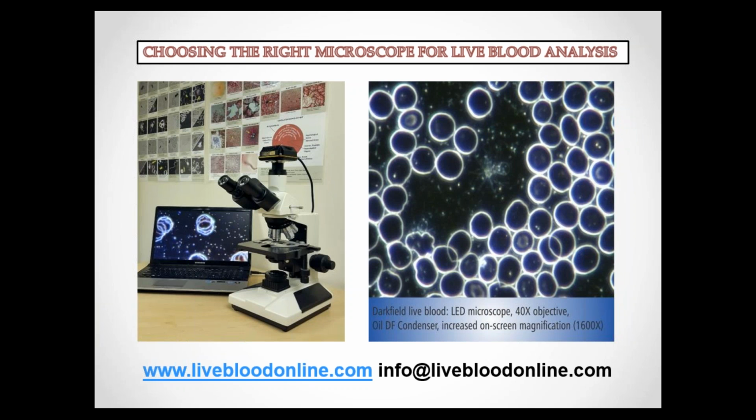In dark field, it's slightly different. The light is actually scattered around in the sample, and effectively the sample is illuminated from the side. So instead of the light traveling through vertically, it's illuminated horizontally in the sample, and this is by means of a dark field condenser that's used under the stage.